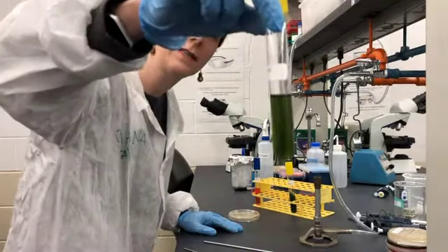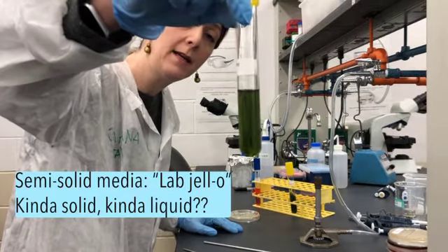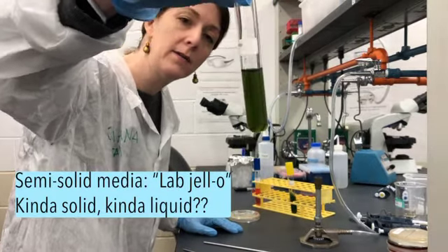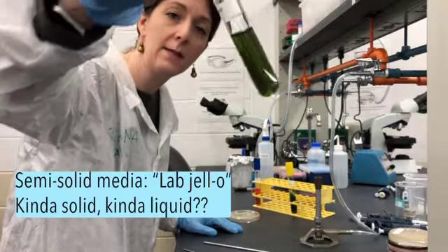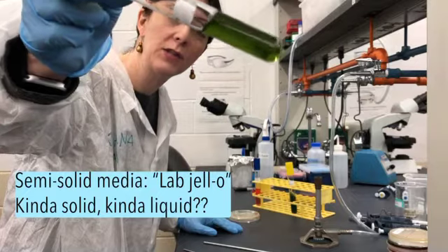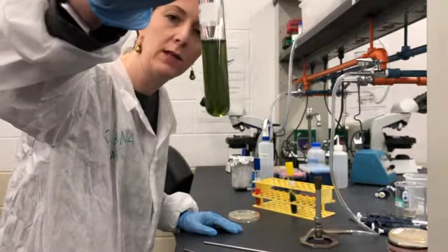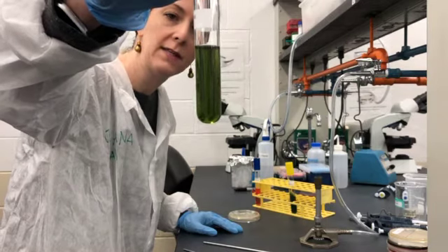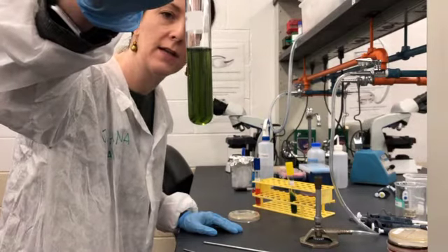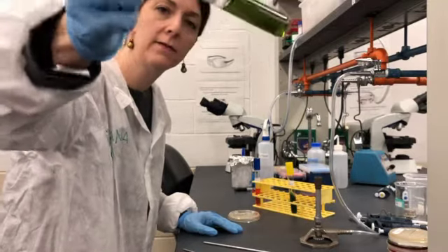This is called semi-solid or semi-solid deep media. And so it appears to be solid media, but if you tip it, you can notice that it actually has a much softer consistency than the media that we use on the plate. So this has about half of the concentration of agar that our plates have.